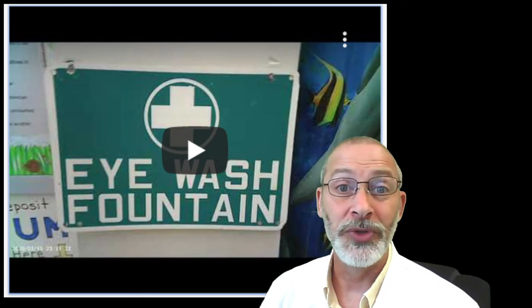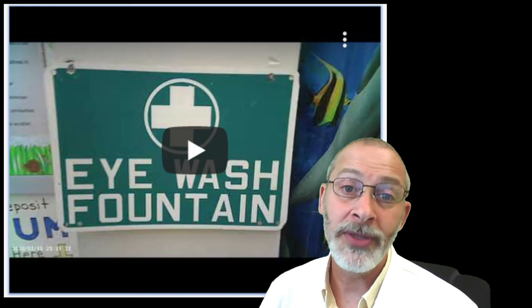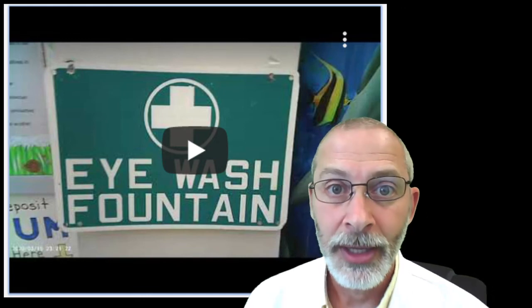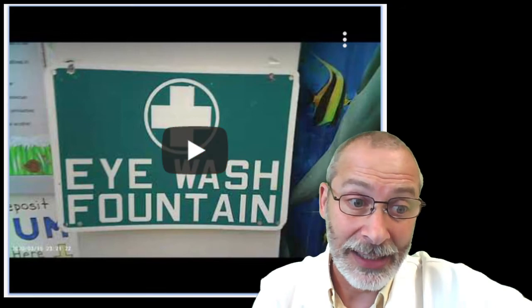And that water comes directly from our well, from the groundwater, which remains about a constant 50 degrees year-round. So after 15 minutes, your face will be numb, but it's better than the alternative of being blinded by chemicals.